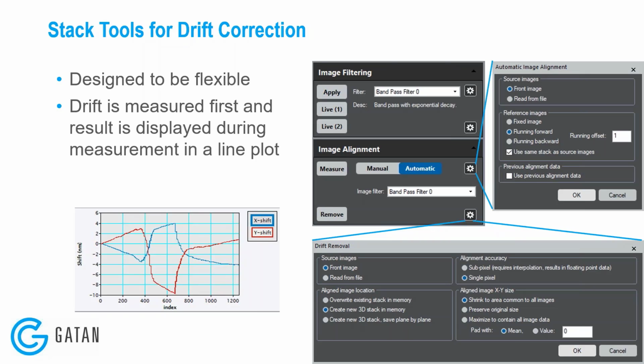And if you want to use this on an in-situ video data set that you have, please contact us, contact me, and I can send you a script that can convert the in-situ dataset to something that can be used with this more flexible but complicated drift correction tool.